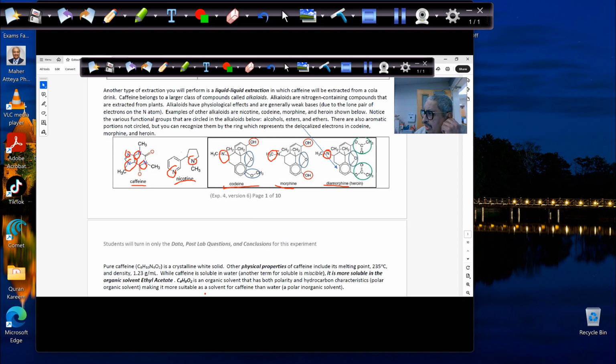What's the difference? The difference is the beaker with the boiling chips, the new one, the last one you have taken, filled with the caffeine, minus the beaker with the boiling chips empty. That will give you the mass of your caffeine. This one we will not say how much you recovered, but at least the direct grams will give us that. If we know the density of the soda solution, we can calculate it, but we will not do that. But at least we record how many grams of caffeine you get.